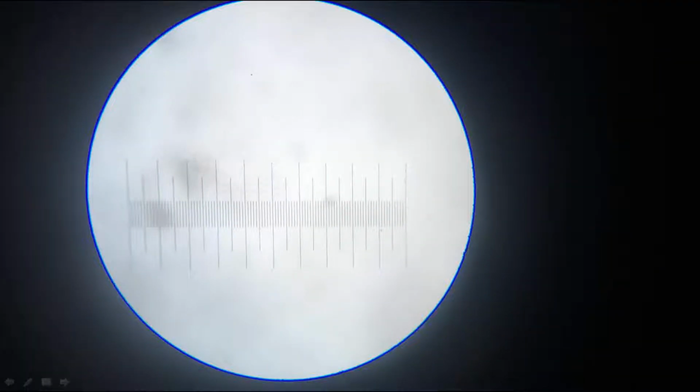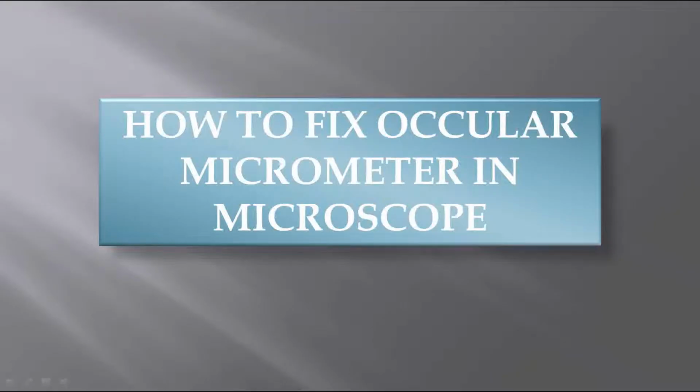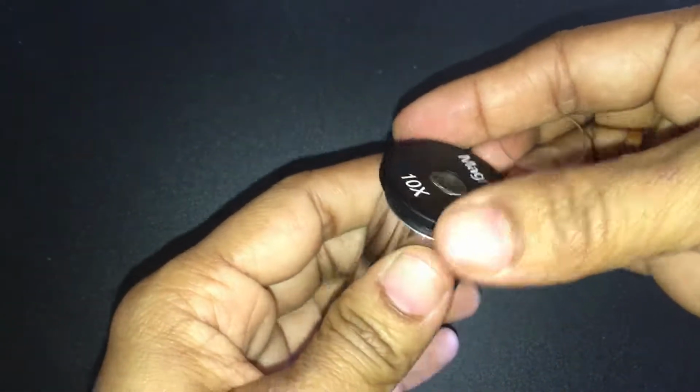Next I am going to show you how to fix the ocular micrometer in the microscope. In the previous slide, I already showed you the appearance of the ocular. It is in the form of a circular disc. So next I am going to show how we need to fix the ocular micrometer to a compound microscope. This is the eyepiece. I am going to open it.